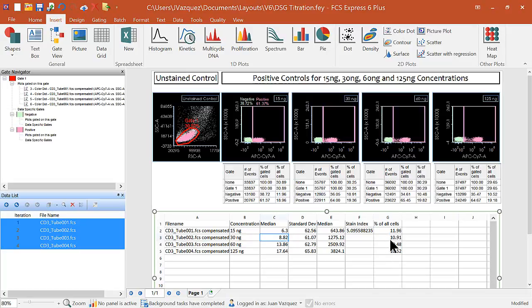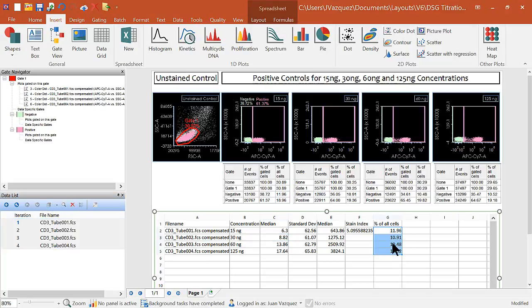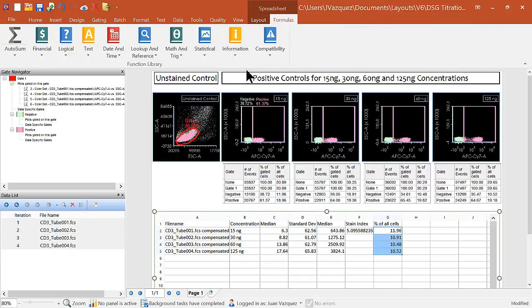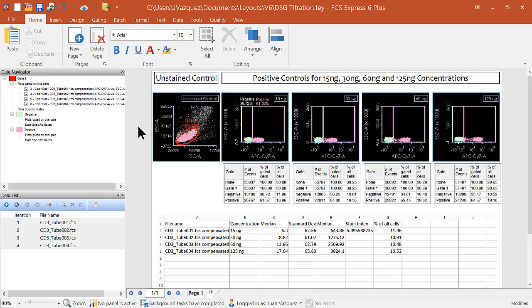What we can also do is we can do a lot of the same functionality as we would in Excel, where if we select our cells, now you can see that we have some tabs up here in the ribbon where we can provide some additional formatting, or we can do some manipulation of that data. We can do some calculations, whether we want to do the sum or an average. A lot of the same type of features that we can do in Excel.